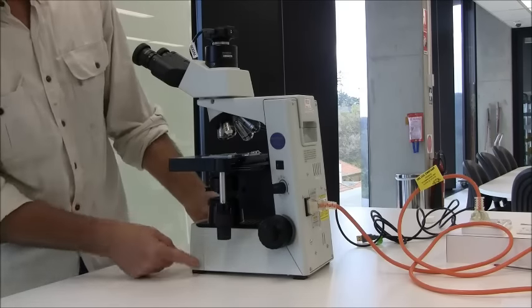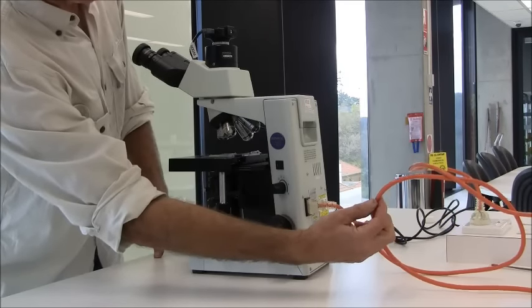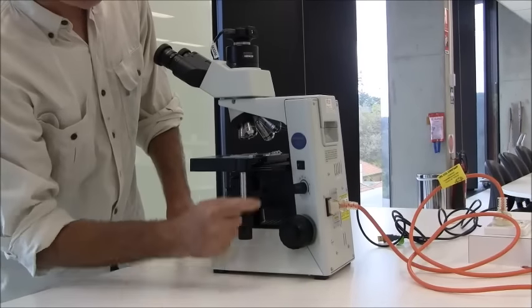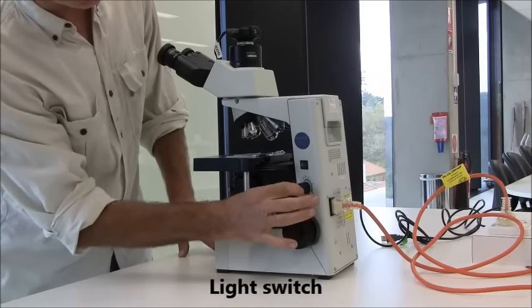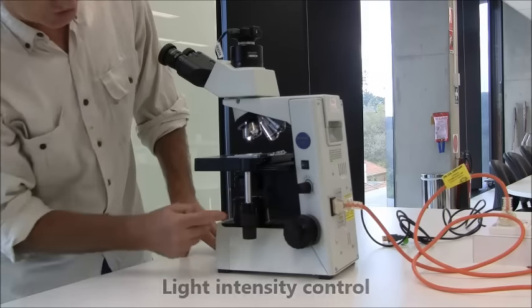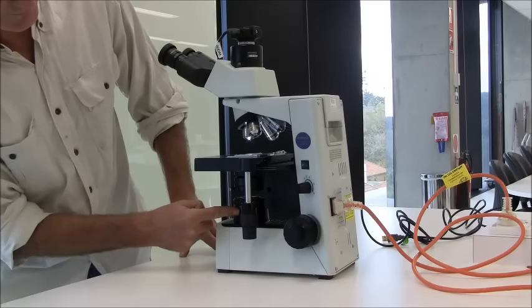The next set of controls I'll show you is the light. You plug the light in, of course, with the mains cord, switch it on at the power, and here is the light switch. The dial beneath it is the light intensity, adjusting the single light source up here underneath the stage.